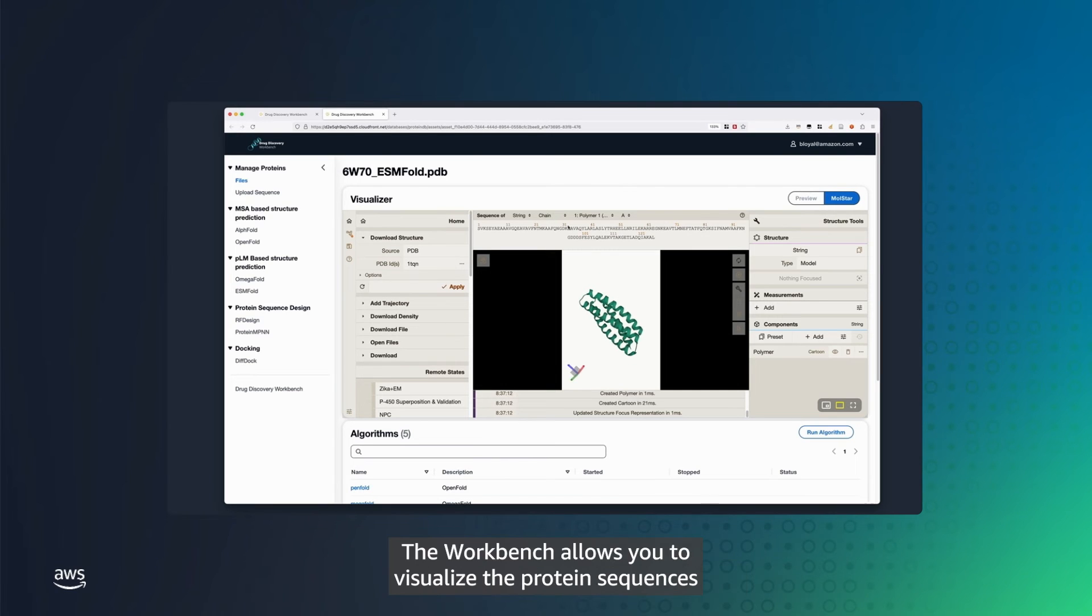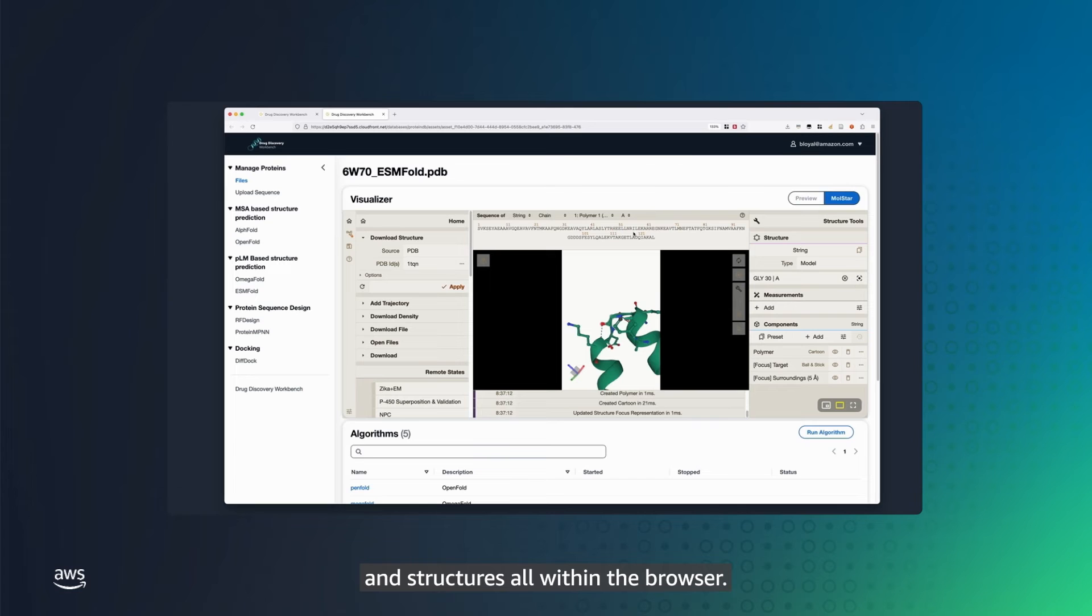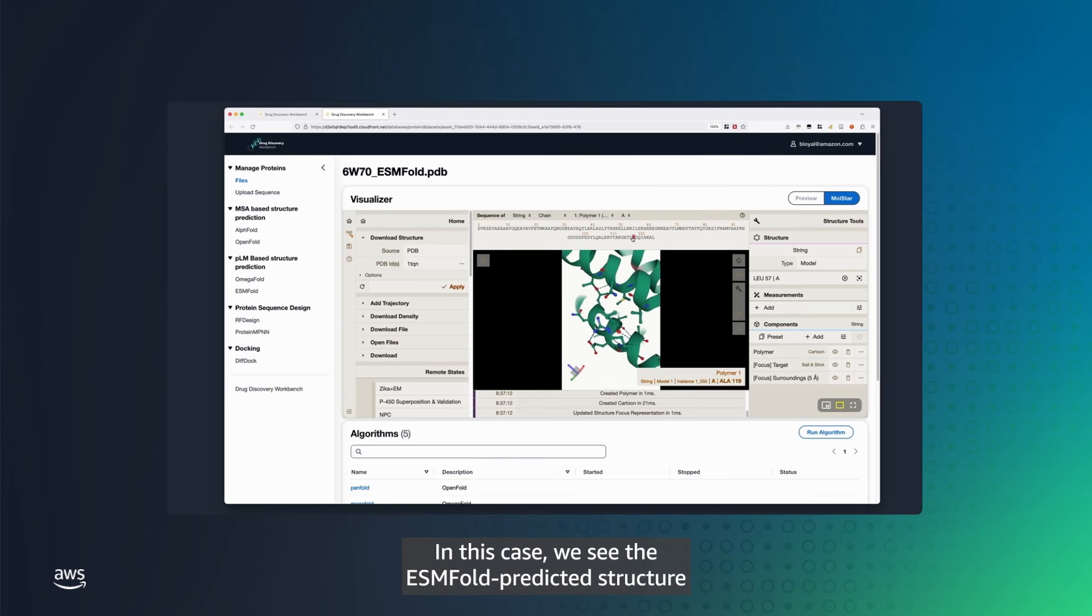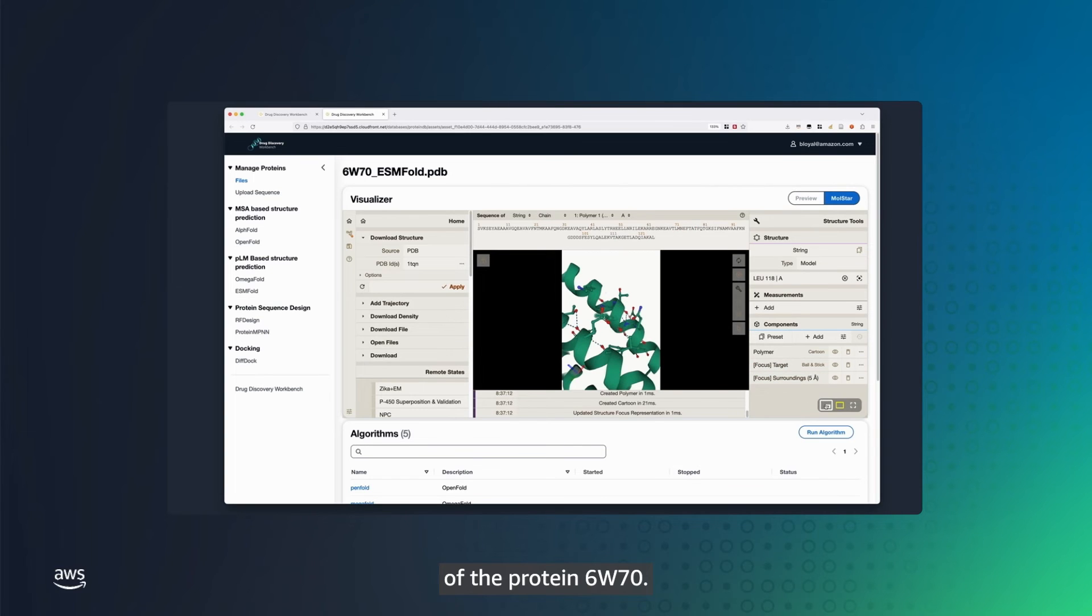The Workbench allows you to visualize the protein sequences and structures all within the browser. In this case, we see the ESMFold predicted structure of the protein 6w70.